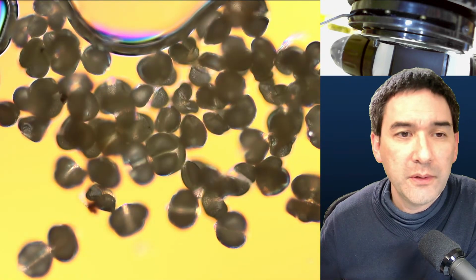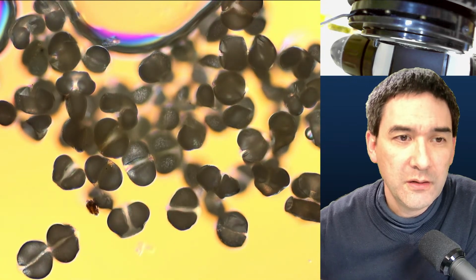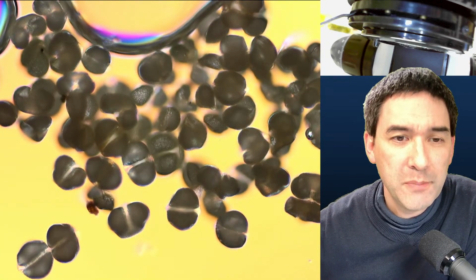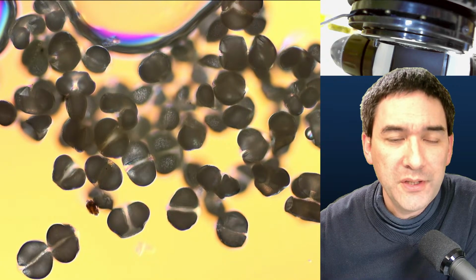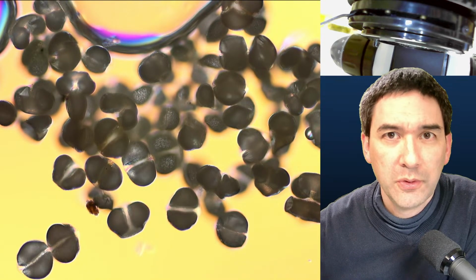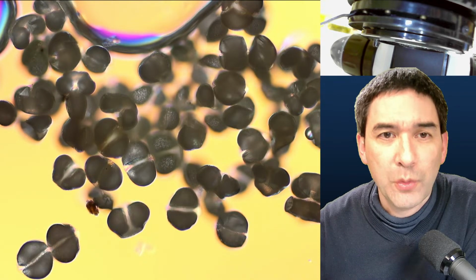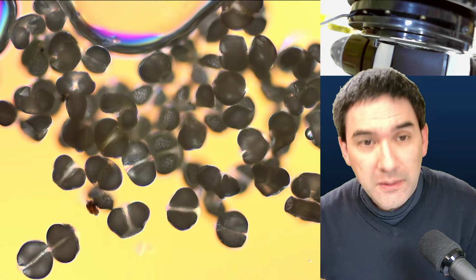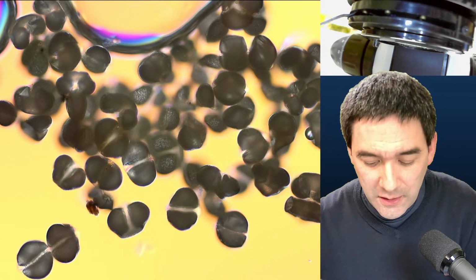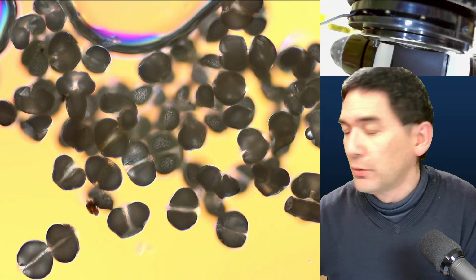I just wanted to show you now what the shape of those pollen grains is like. Okay, see that there are two parts to it, and that does become a little bit important because we're going to see that in the different mounting media, the shape looks different. The reason is because this is glycerol, but some other mounting media will actually cause a shrinking of the pollen. Okay, so this is now in pure glycerin.